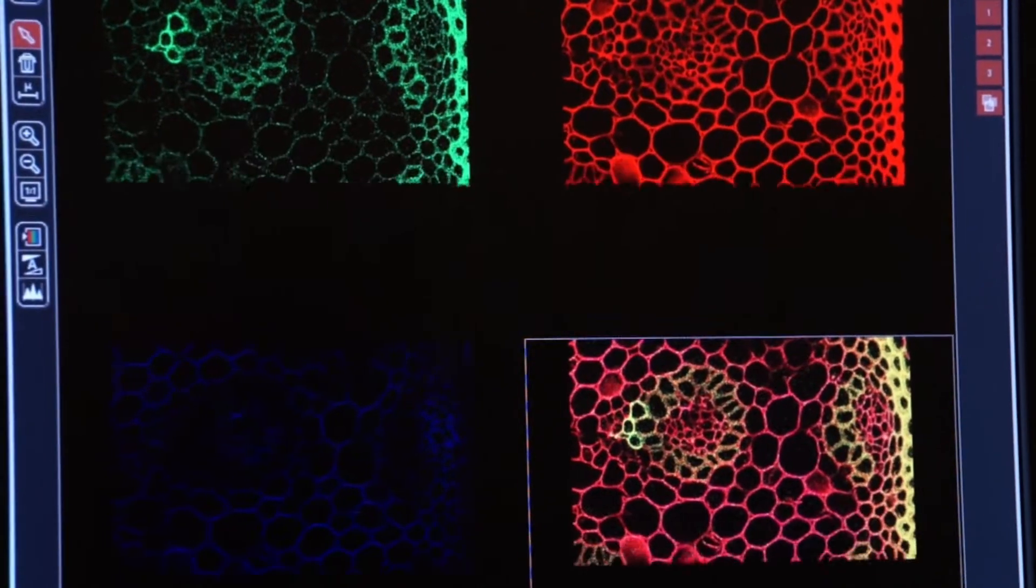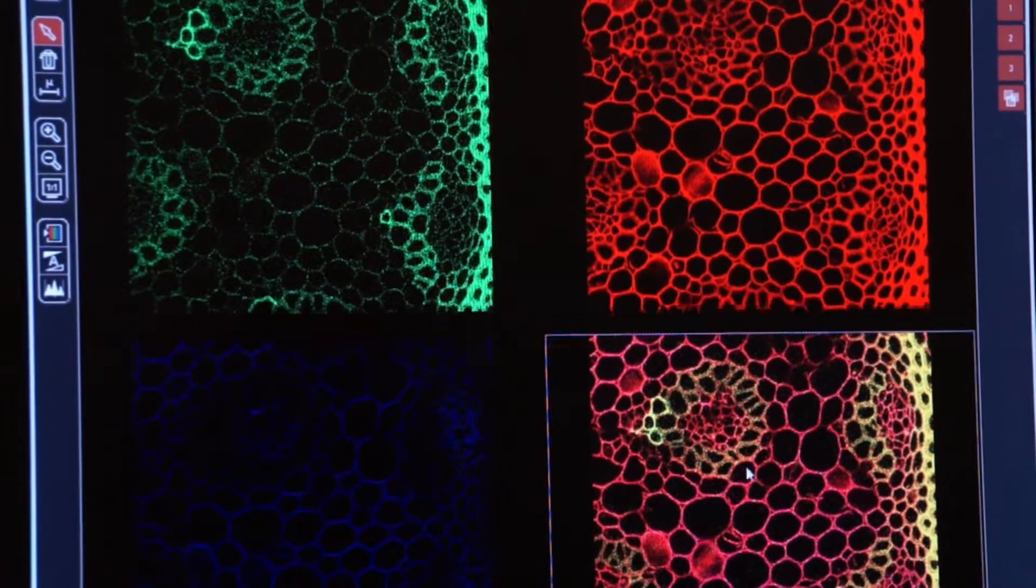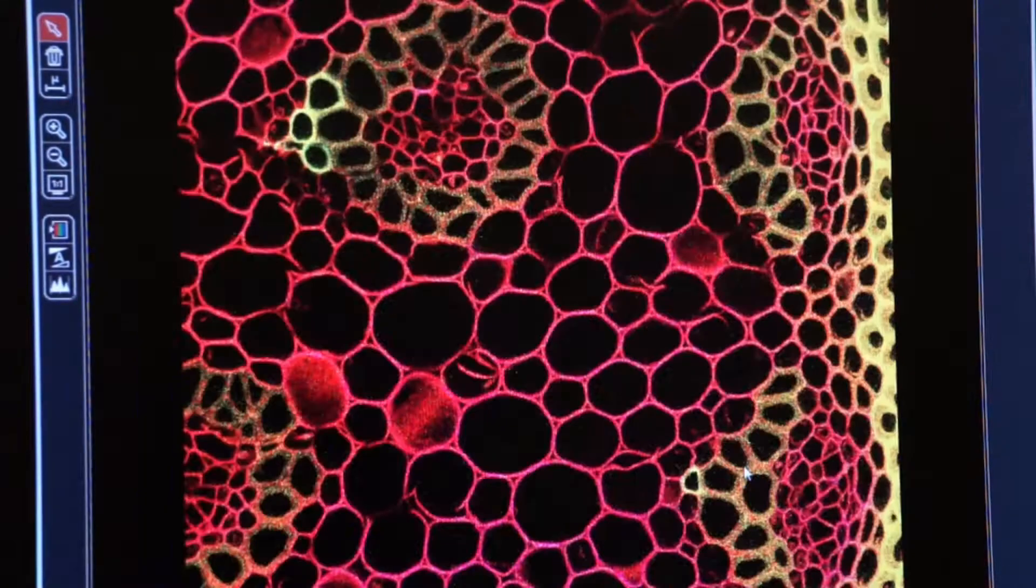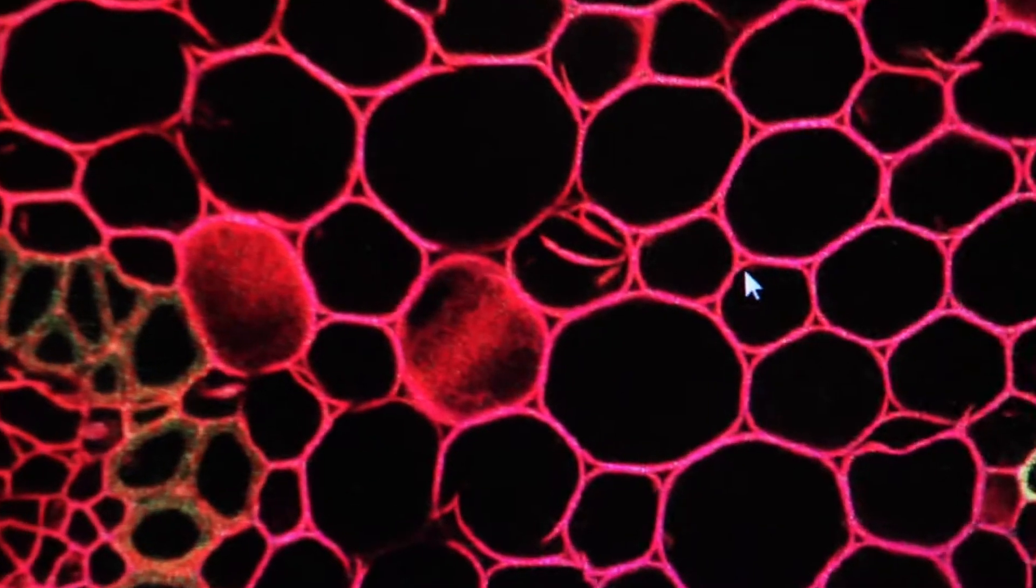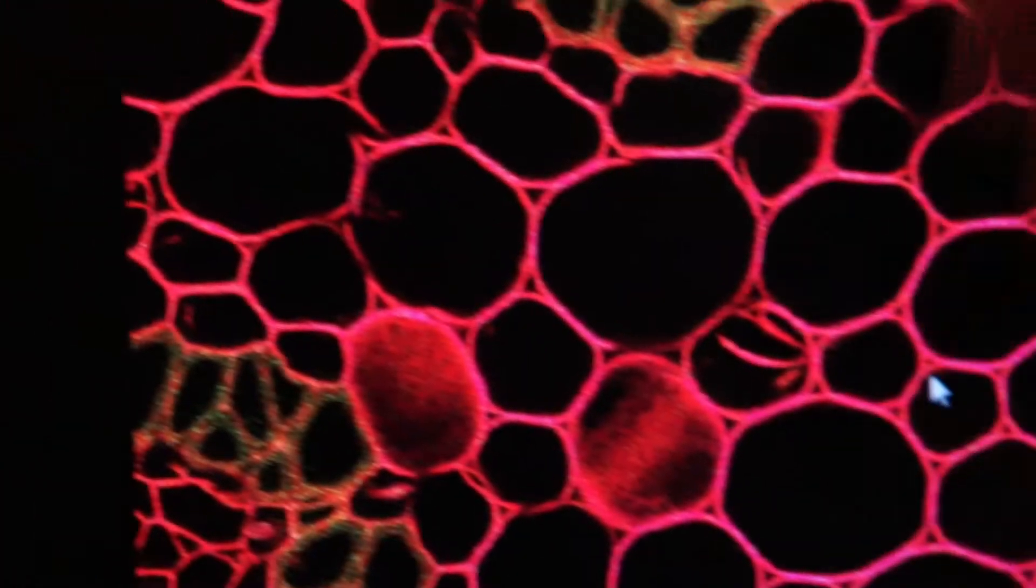Again, there's always trade offs. And here you see, it's become a little more pixelated again. We see some pixels in here, but it's still scanning. So some of those pixels will go away over time.